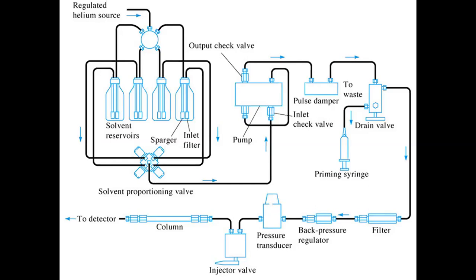If dissolved oxygen is present in the liquid we are going to use as a mobile phase in the forthcoming step, the oxygen has to be removed. Otherwise, oxygen will create a problem, because it is a strong oxidizing agent that may destroy the solute molecules during the separation process.